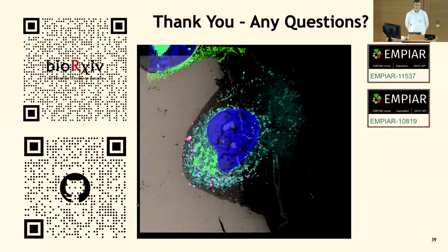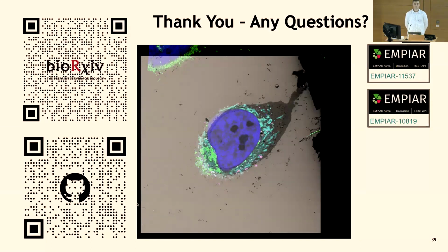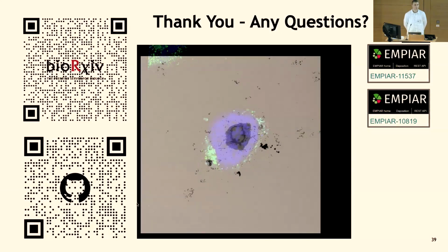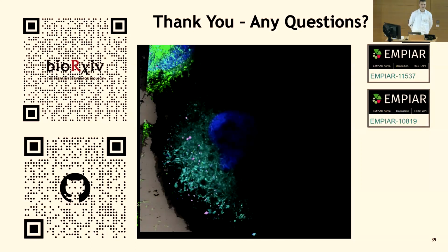Hi, great work, thanks. I have 2 questions. The first one is, does CLEM-Reg output affine registrations only, or can it also do nonlinear stuff? And the second question is if you've worked with other organelles as well, apart from mitochondria.